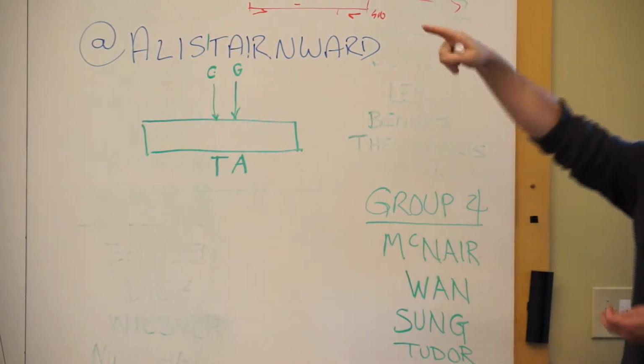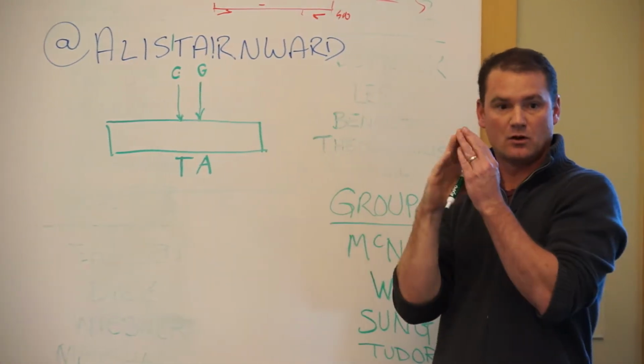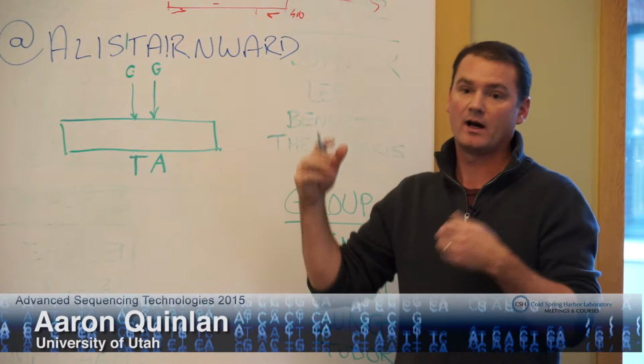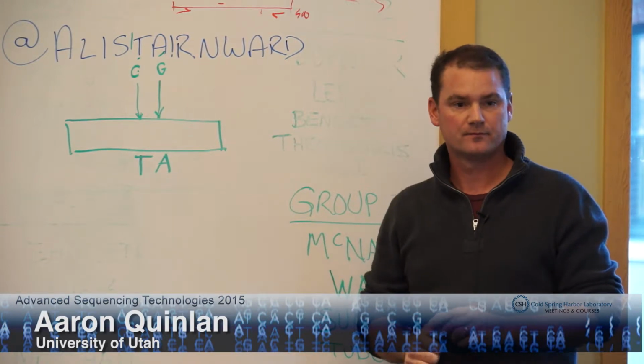So what this program does is go back and recognize that these are so close to one another that you can figure out whether they're on the same allele and adjust the prediction. Sometimes you can say, well, actually, these two changes compensate for one another.